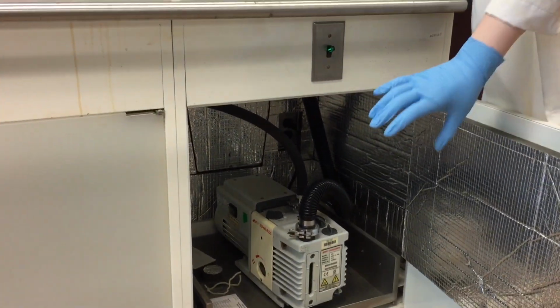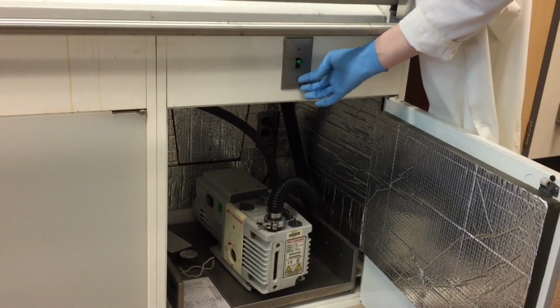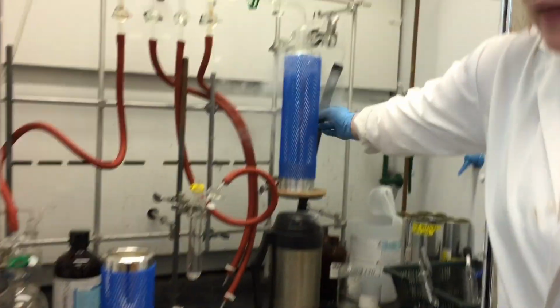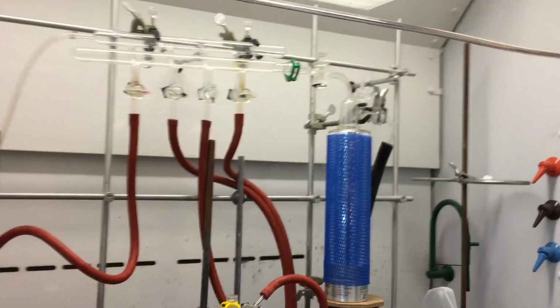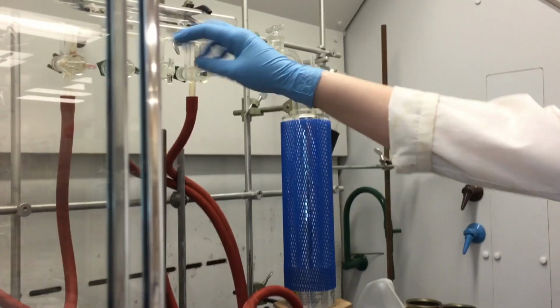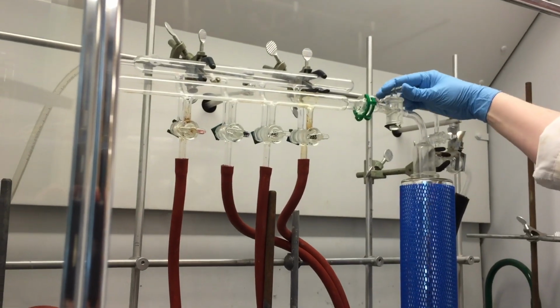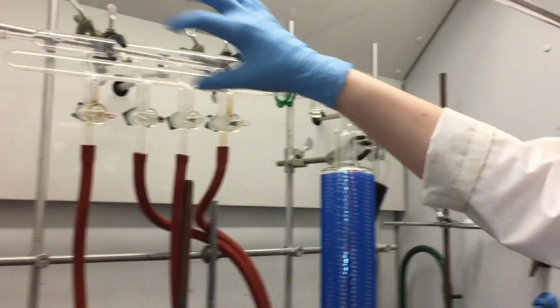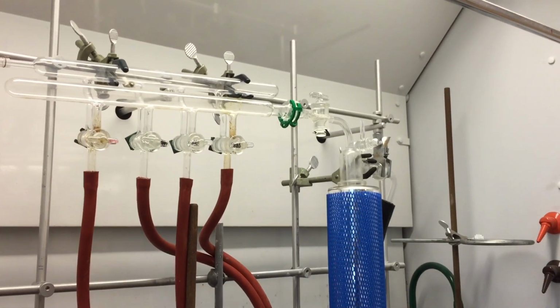Okay, so our vacuum pump is located down below the fume hoods. You're just going to flick on your power source, however it is, and then it will come through this black line back here, and we now have vacuum under this region right here. So the next thing you can do is, with all your other taps closed, open up the vacuum to the Schlenk line. You'll hear it gurgle a bit. It's just getting all of the atmosphere out of the Schlenk line.